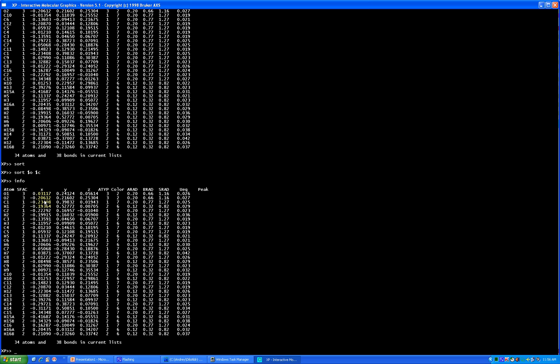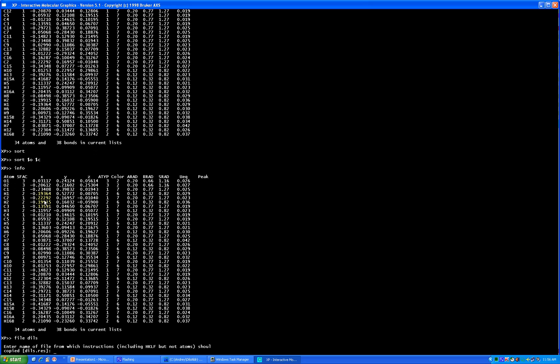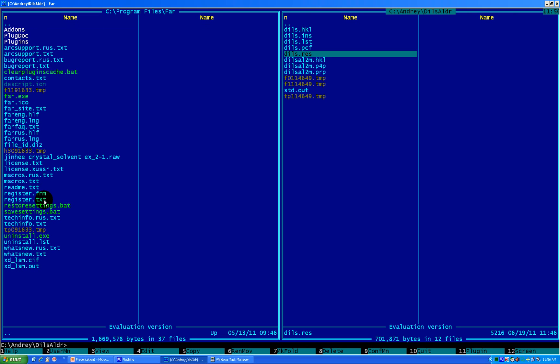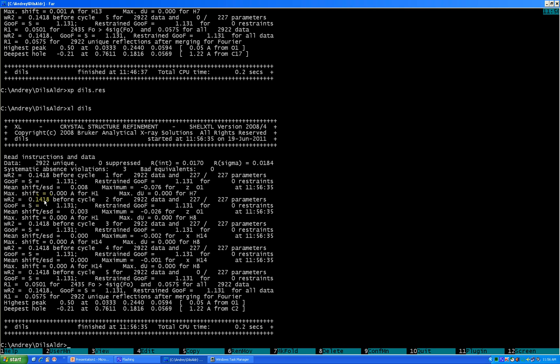Now do 'file' then run the refinement again. That is our first step in preparation for publication. You can now see our shifts have come down to zero, which is quite nice.